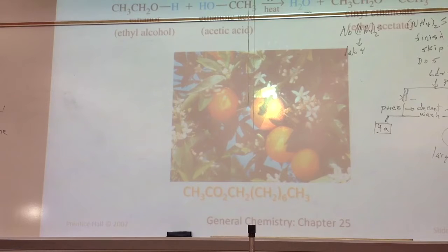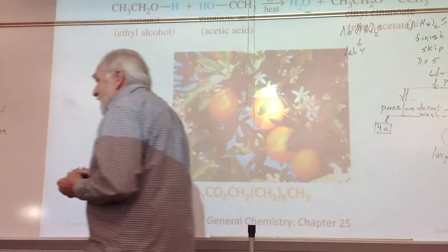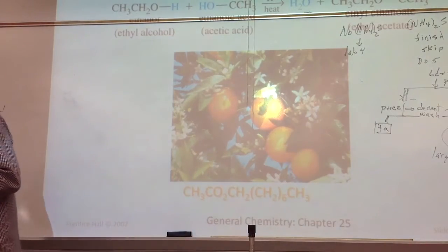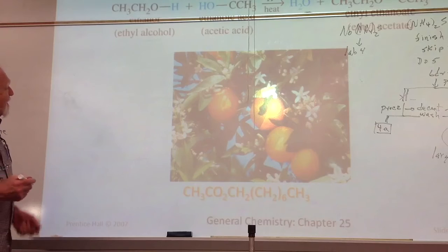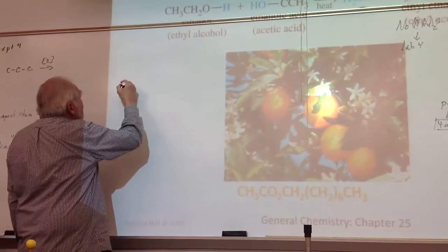You take something like a 4-carbon alcohol and a 4-carbon or 5 or 6 carbon acid. One smells like rotten cheese and the other smells like sick goats. And you mix them together and you make Chanel number 5. Okay? That's the esterification reaction. Making esters. The interesting thing, just do this.